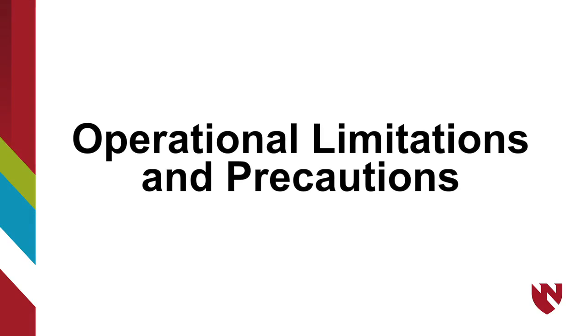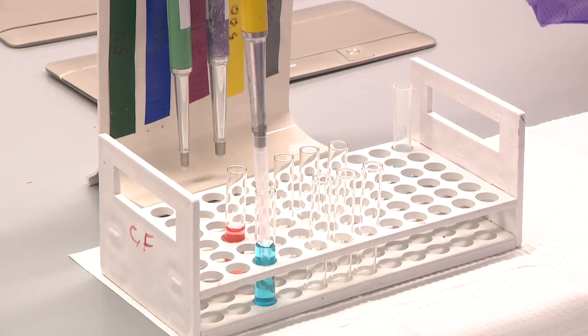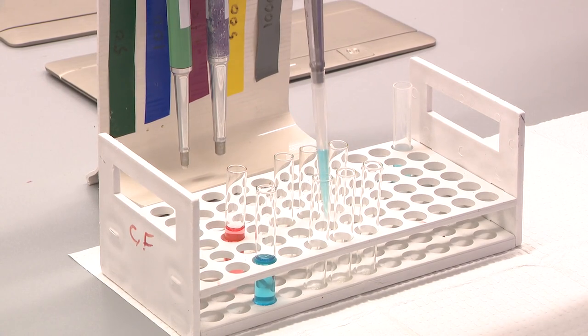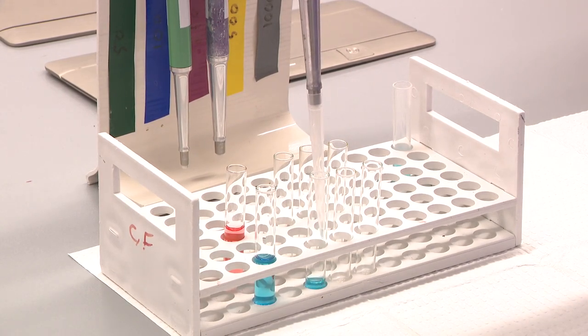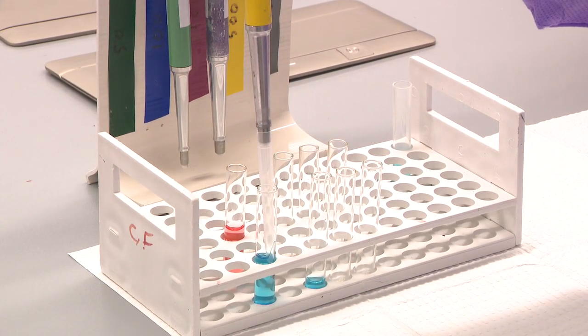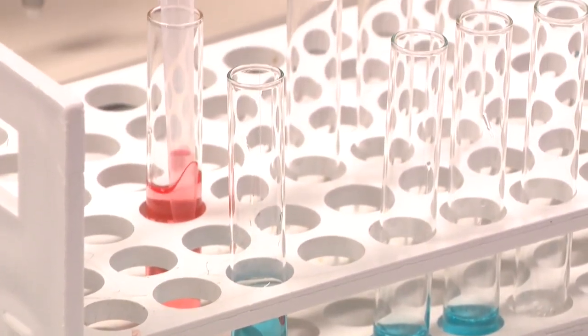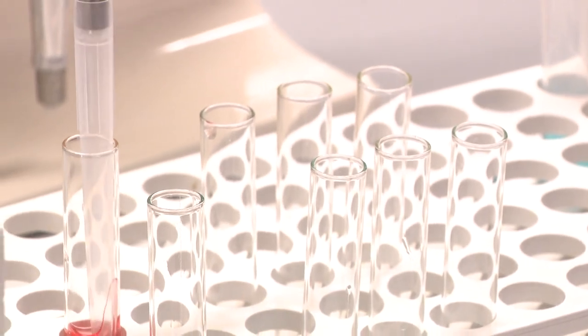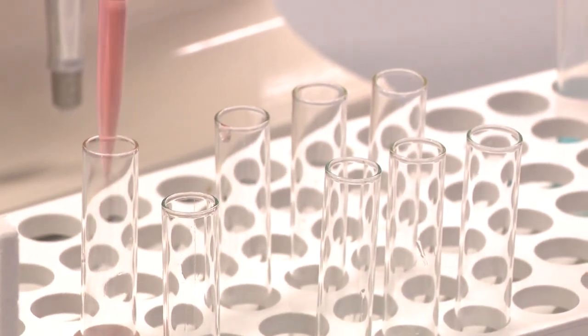Operational limitations and precautions. When pipetting serum or other biological fluids, a liquid film may be retained in the tip that can change the pipetted volume. Pre-wetting the tip with the liquid to be pipetted can reduce this effect. Please refer to the written procedures for more details.